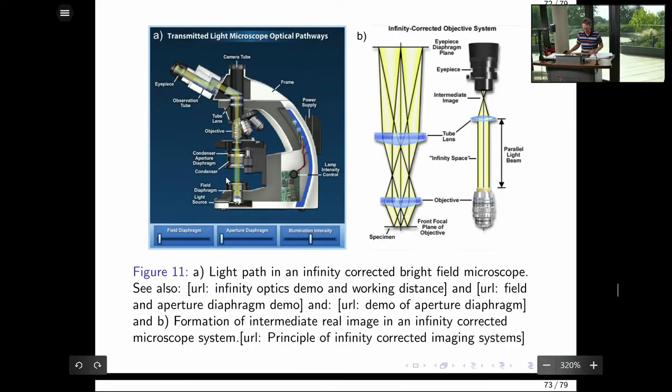Okay, so I go back to the presentation again. So you see here a microscope that's an upright system. So you look at it from the top. That may be very useful for many things. Usually simple microscopes are upright microscopes. So inspection microscopes, you'd have something like that. So here's one example. It's self-explanatory.